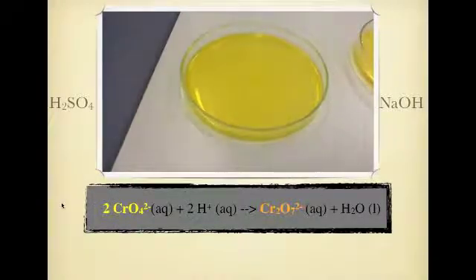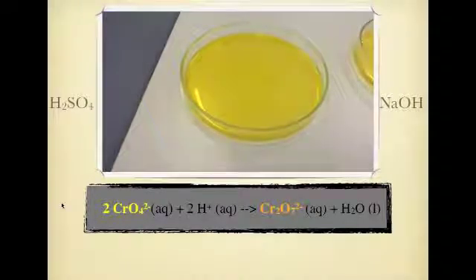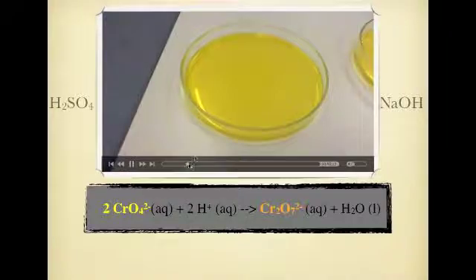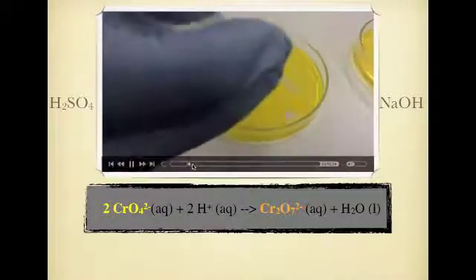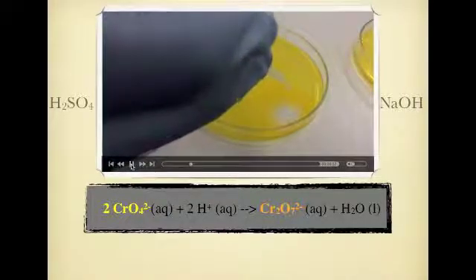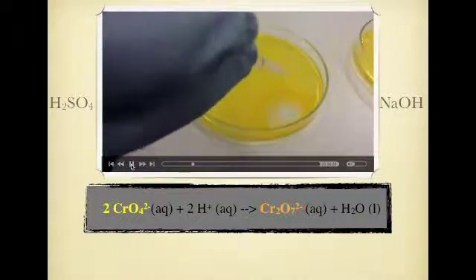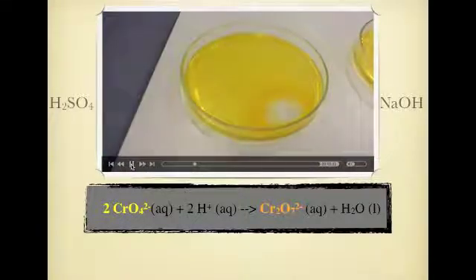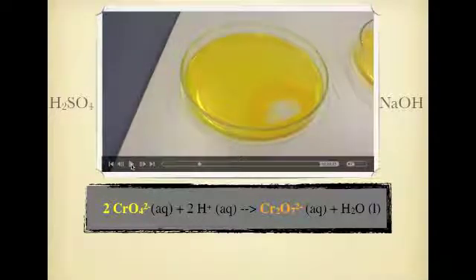The equilibrium in this solution is based around this equation here. So first of all, I'm going to get my pipette and drop some sulfuric acid into the petri dish, and there I go. Starting to add my sulfuric acid. A good few squirts. It says five drops in the demonstration, but we'll do a few extra.